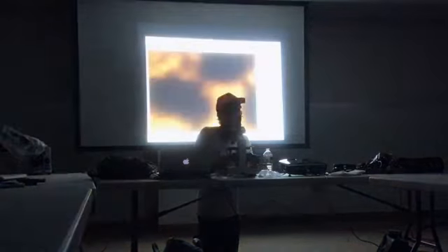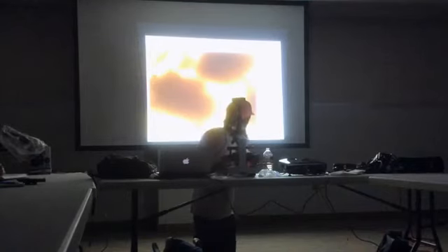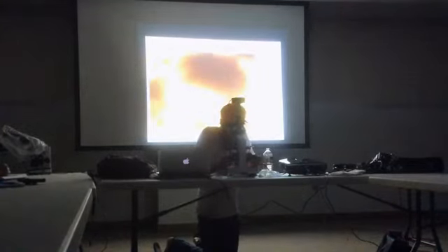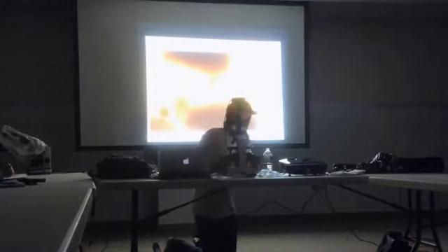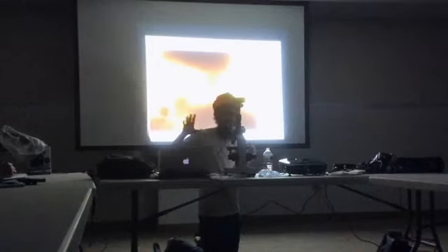So what I try to do is just scroll to some random spot and then look to see what I'm working with here. You guys can't see it, I have a little bit wider field of vision here. But this guy was in my field of vision. So I scrolled to some random spot on my slide, a random view is what this is called.